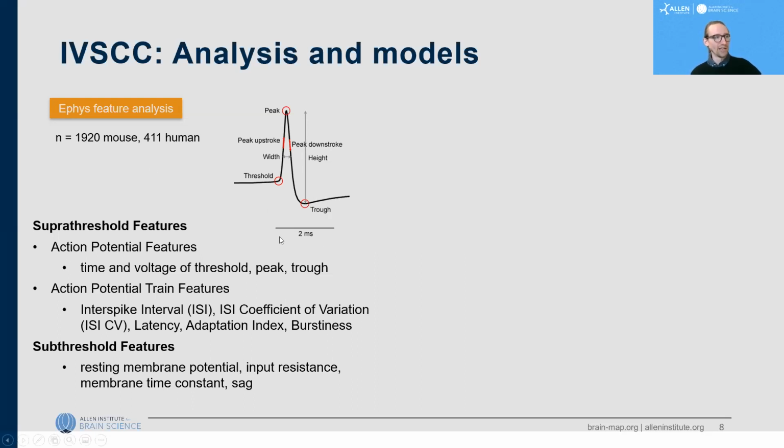I should say we're always working on adding more features that better inform the analysis of cell types. A more basic set is available in what we'll be showing, but we also released the more cutting edge tools in a newer analysis package called IPFX, which is also publicly released.